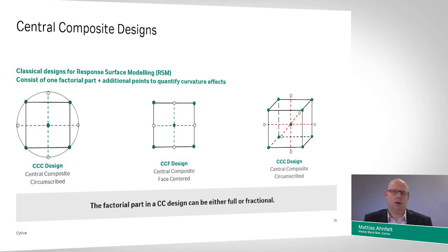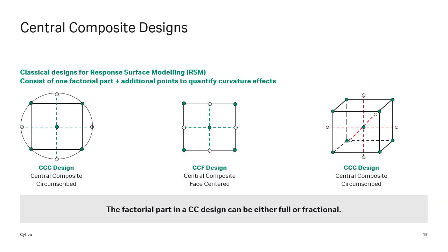If we have a plateau or a minimum or a maximum, those results will describe that for the model or for the evaluation. And we have another unique direction going top to bottom where only that direction is changing, which enables quantification of the second-degree curvature in this direction. Another alternative to make a central composite design is to put the so-called star points on the face of the square instead of on a circumscribed sphere, which is also an option in experimental DoE.